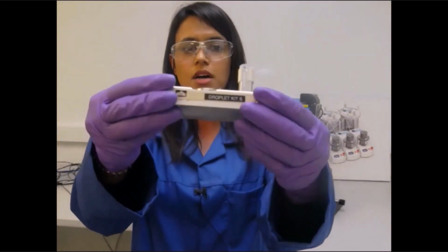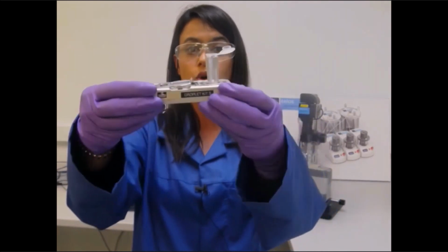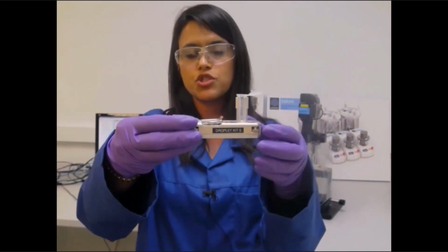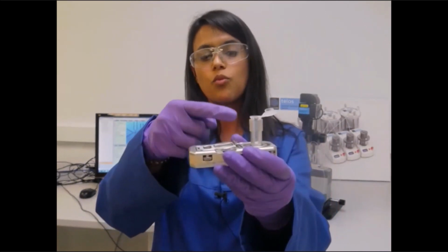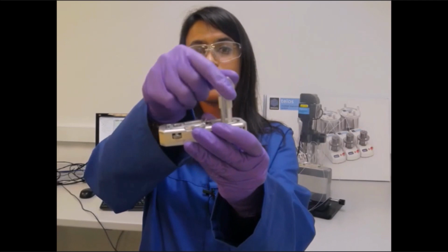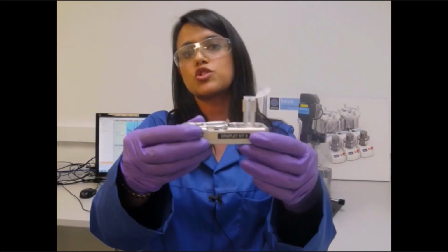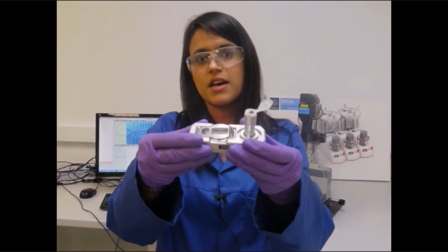So this is, again, not at the moment mounted on the TCU, so you are able to work without the TCU if you don't want temperature control. And then once the droplets have been produced, they are collected into a typical Eppendorf tube, and then you have a cover on top, which allows you to maintain some temperature if you desire that.